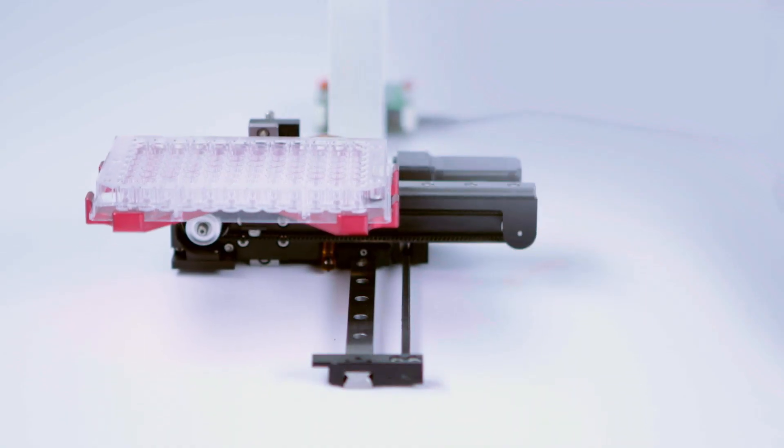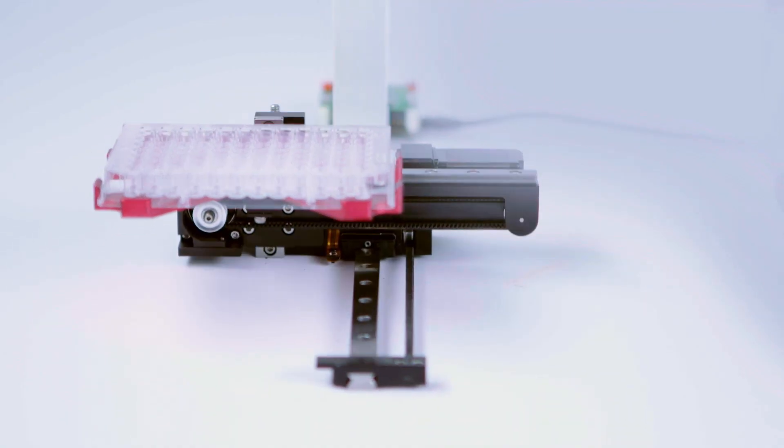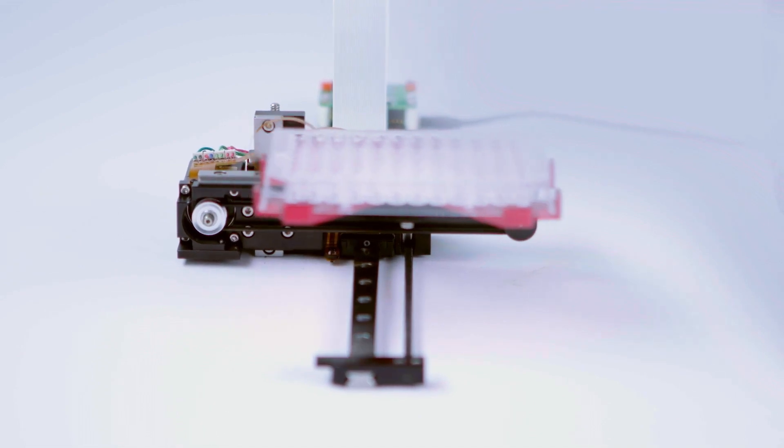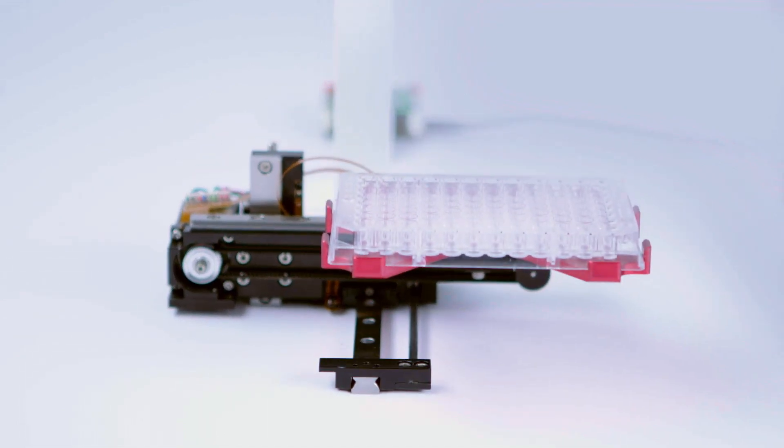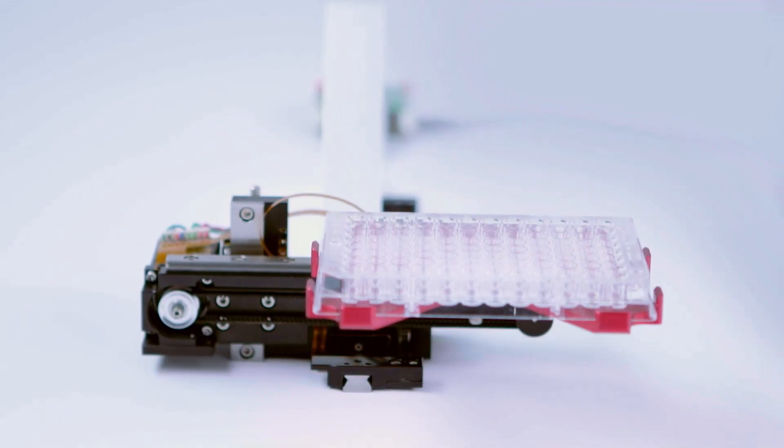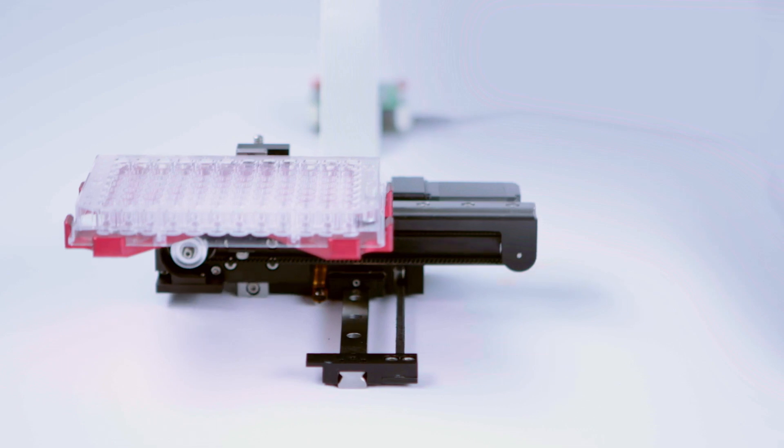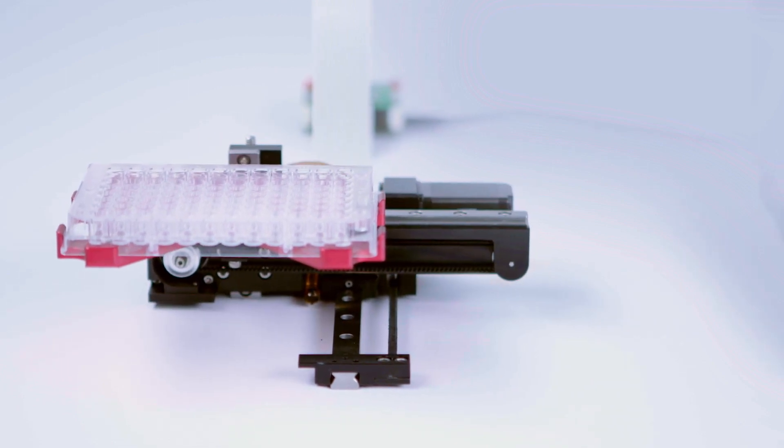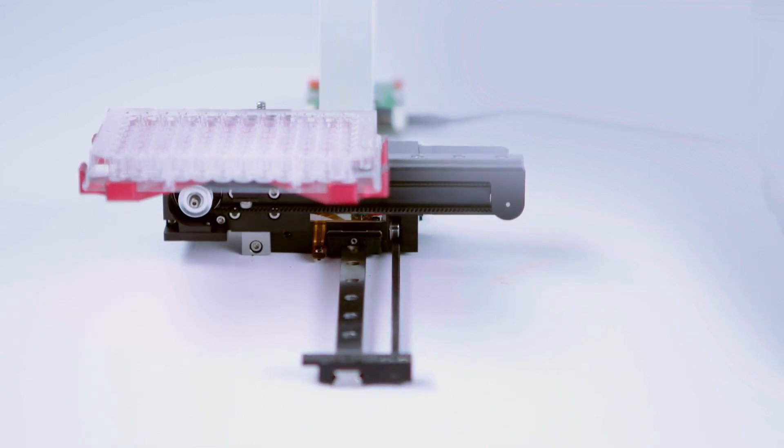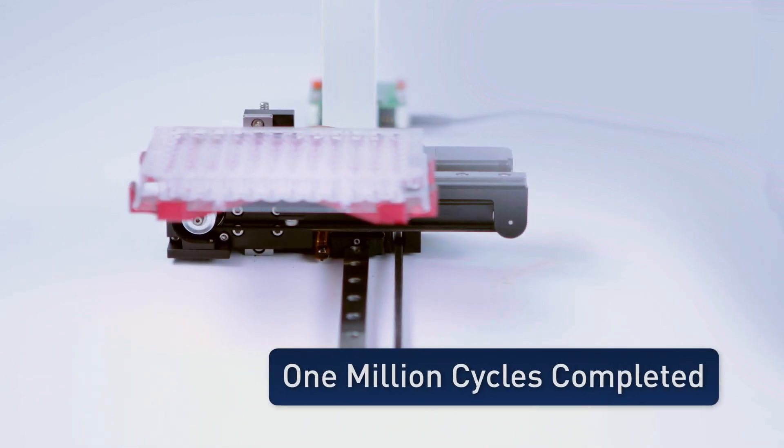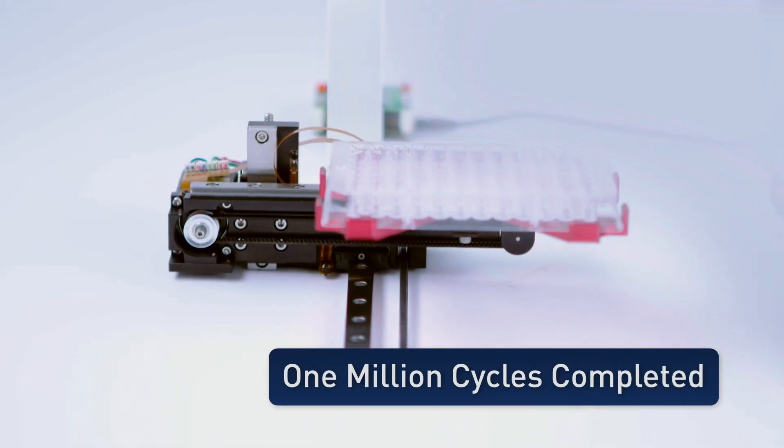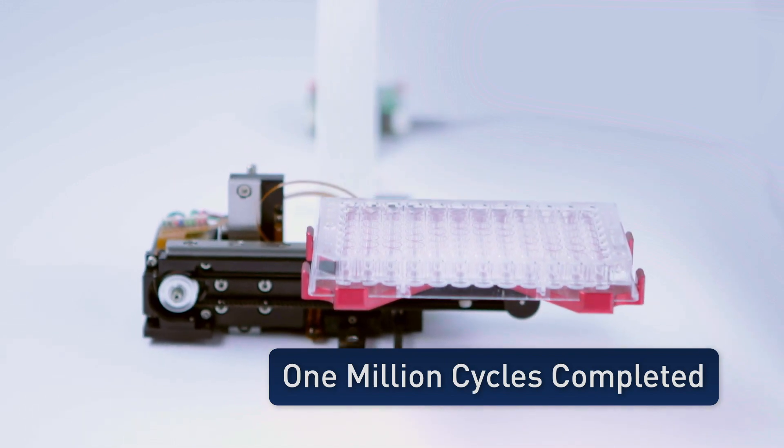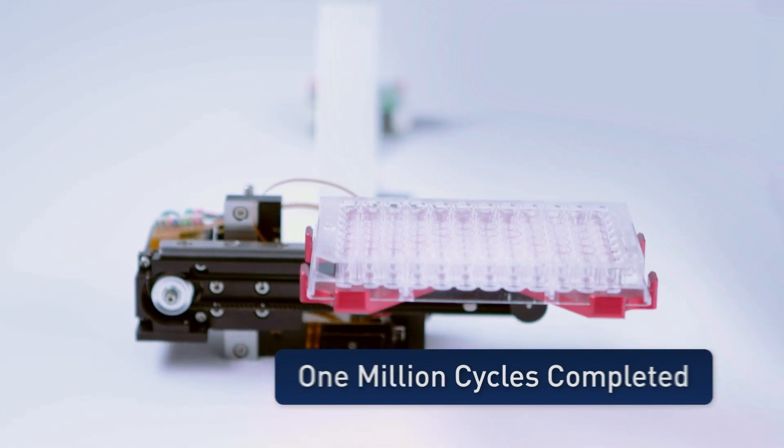As a pre-engineered and tested solution, this part of your instrument will not need to be prototyped. The robot can be implemented with confidence. The bearings, belts, and cable management have all been tested to over a million cycles and the performance specifications verified to hold true after the life tests.